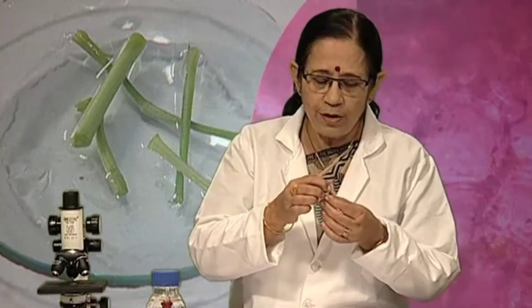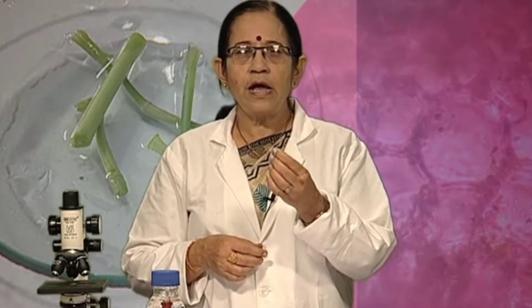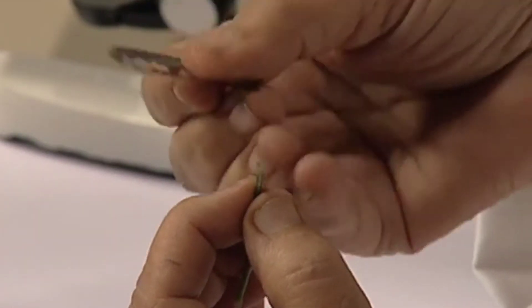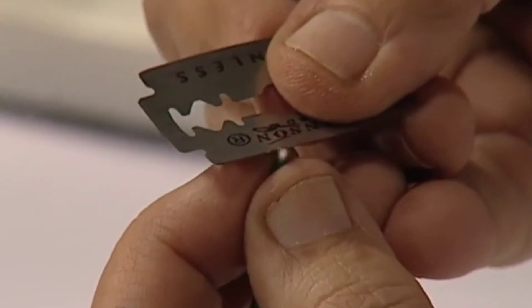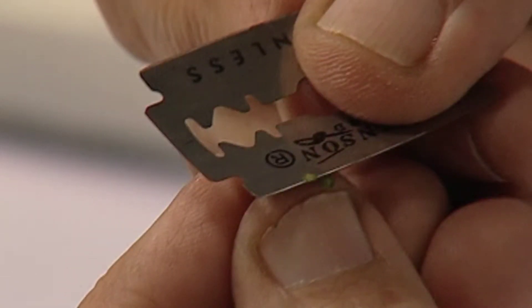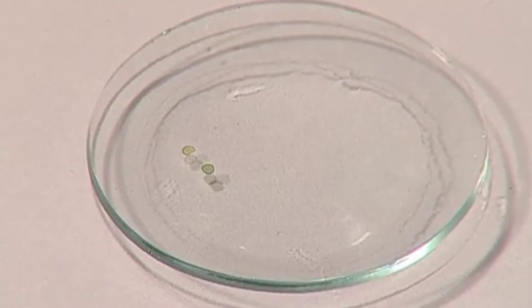Now let us start cutting the section of a stem. For this, you need to hold the stem in your left hand in an upright condition and hold the razor blade in your right hand at right angles to the axis of the stem. Try to cut very thin sections of the stem, as thin as possible, and then put these in water. Here you can see I have cut sections of the stem and put them in water.